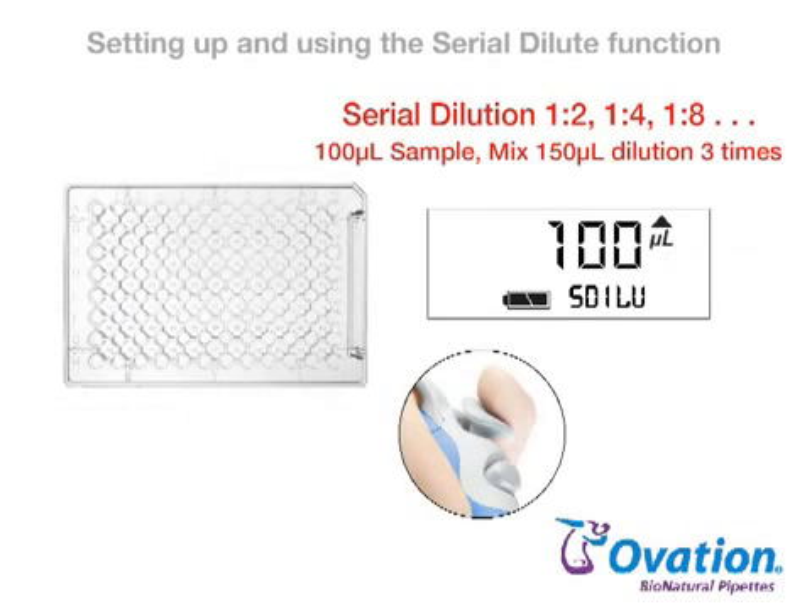Aspirate 100 µL of sample by pressing and releasing the pipetting trigger. Then place the tips into the first diluent-filled row and press and release the pipetting trigger to dispense sample into the diluent, followed by three mix cycles. After mixing, 100 µL of the diluted sample is automatically aspirated.